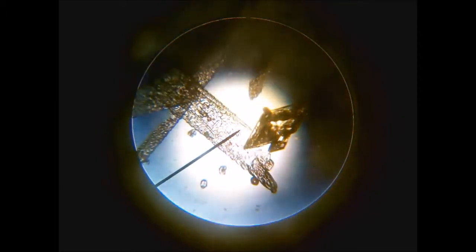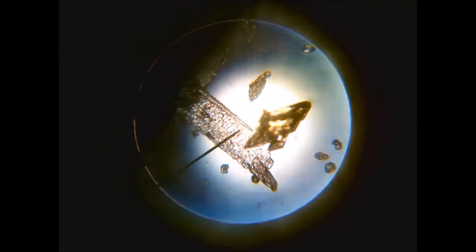In any case, we are here. This is the thing that I wanted to show you. So off to the side, we have a nice, reasonably sized orthorhombic crystal, which I am blinding you with. But off to the side, we have something a tad bit more interesting. We have some monoclinic sulfur crystals. Now, the presence of monoclinic sulfur crystals isn't all that surprising. We've been working with monoclinic for a while, and it's entirely possible that the slide just got contaminated. After all, we didn't take the hot plate above 80 degrees Celsius, so we did not achieve the temperature necessary to melt the sulfur.